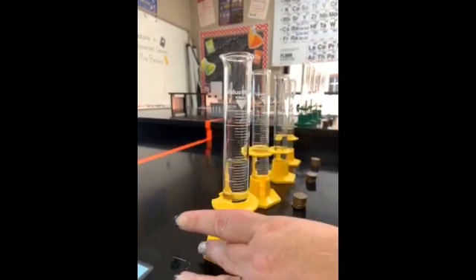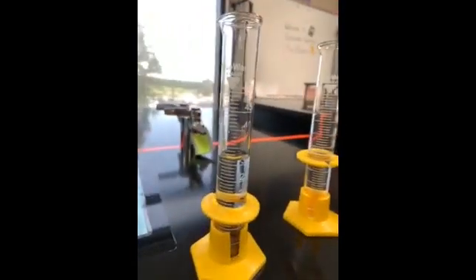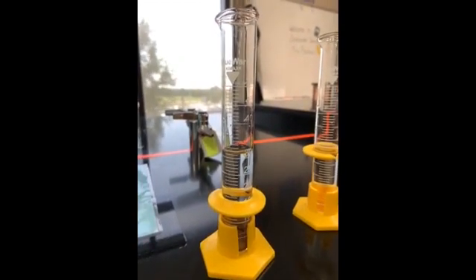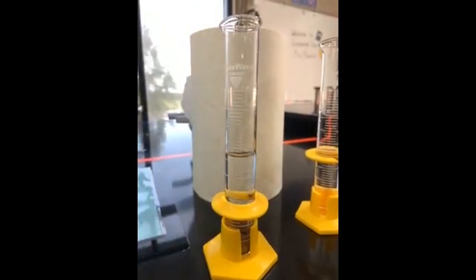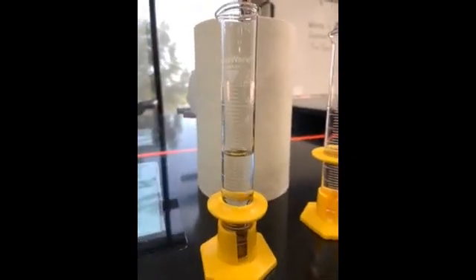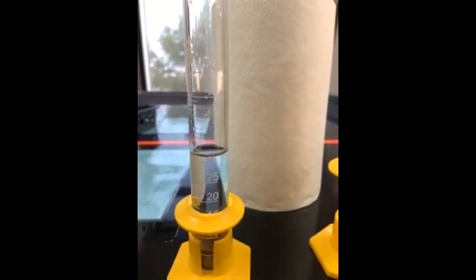Again, we tip it so that it doesn't break the glass. And now our volume looks like 30.21. It's not quite on that line. So 30.21. By the way, these lines are going up at 0.2 intervals. So we have our volume of just the water for trial 1.